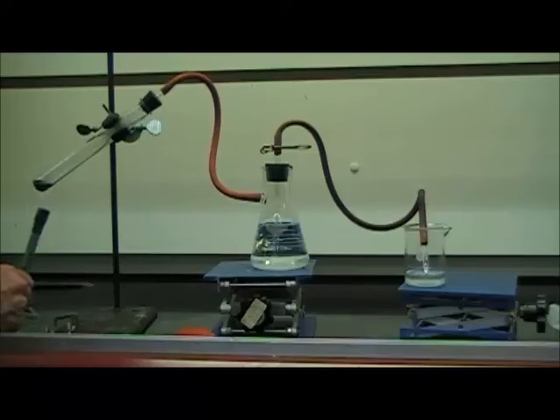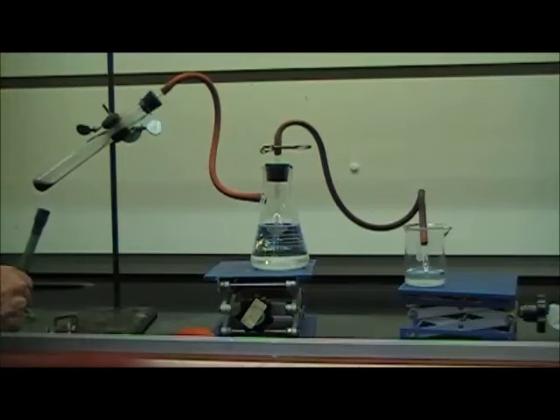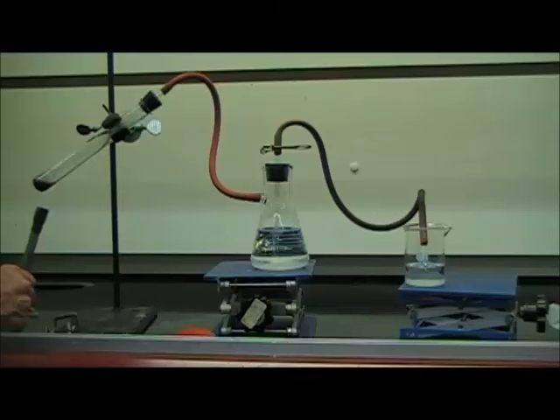Now, a question always arises at this point: when do you know you're done? Well, you can stop it at any point as long as you have significant amounts of water coming over there. The more the better. But again, you don't want the level in this flask to go below the bottom. So I'm just going to keep on heating it and keep on producing oxygen.